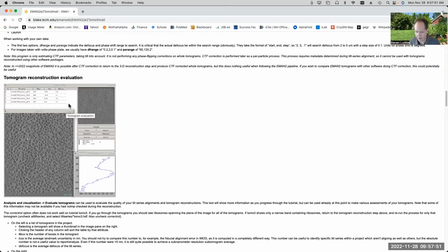On the tomograms. And the only thing we're using the tomograms for, again, is for particle picking, basically, in this case, so that improvement isn't warranted in most cases.